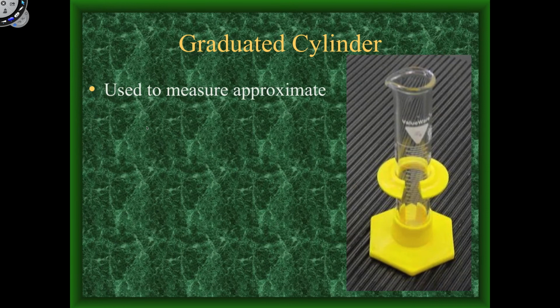Graduated cylinder. Use these items, graduated cylinders, to measure volume. You never, ever heat graduated cylinders. The glass is not made to be heated. The only thing you use graduated cylinders for is to measure volumes.